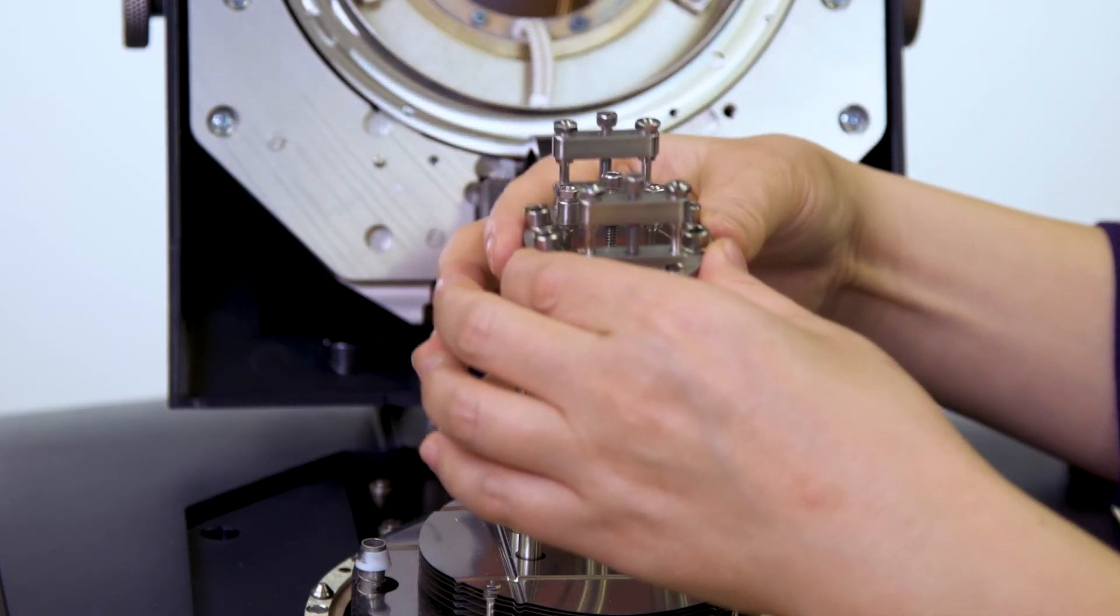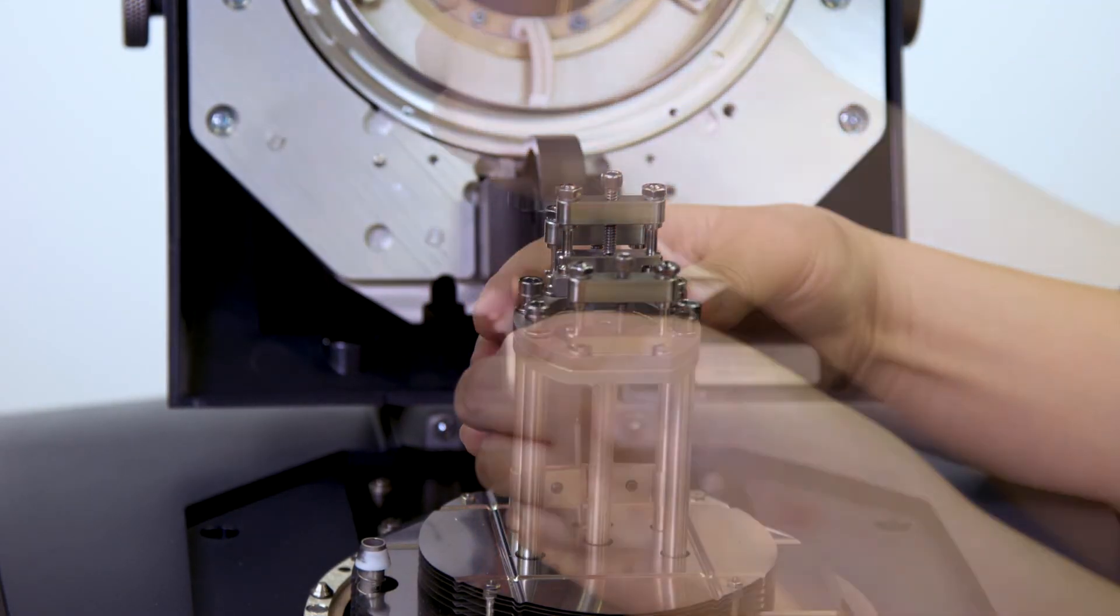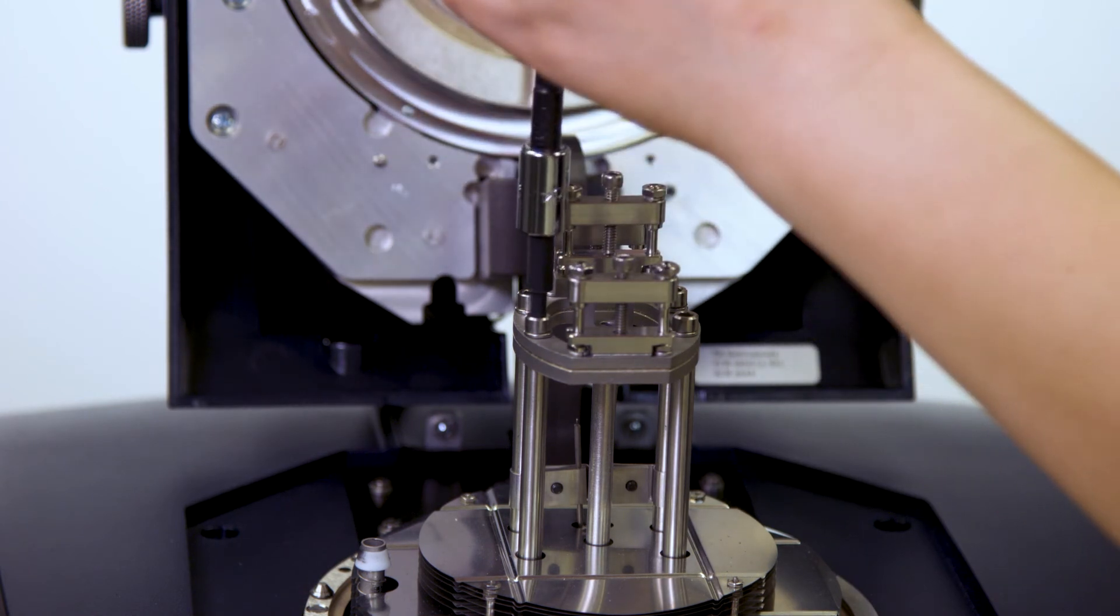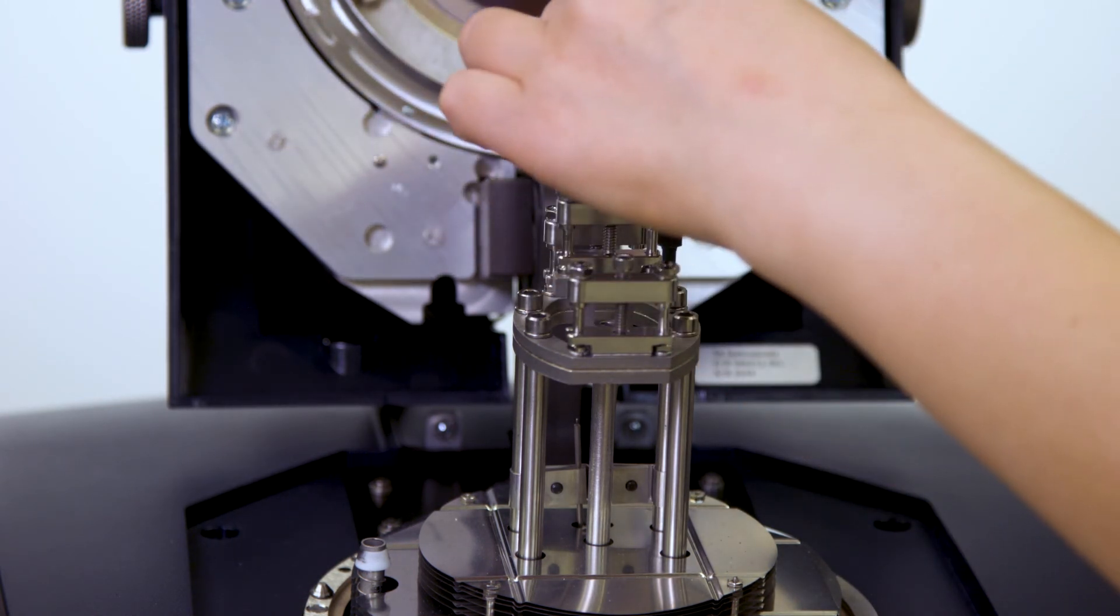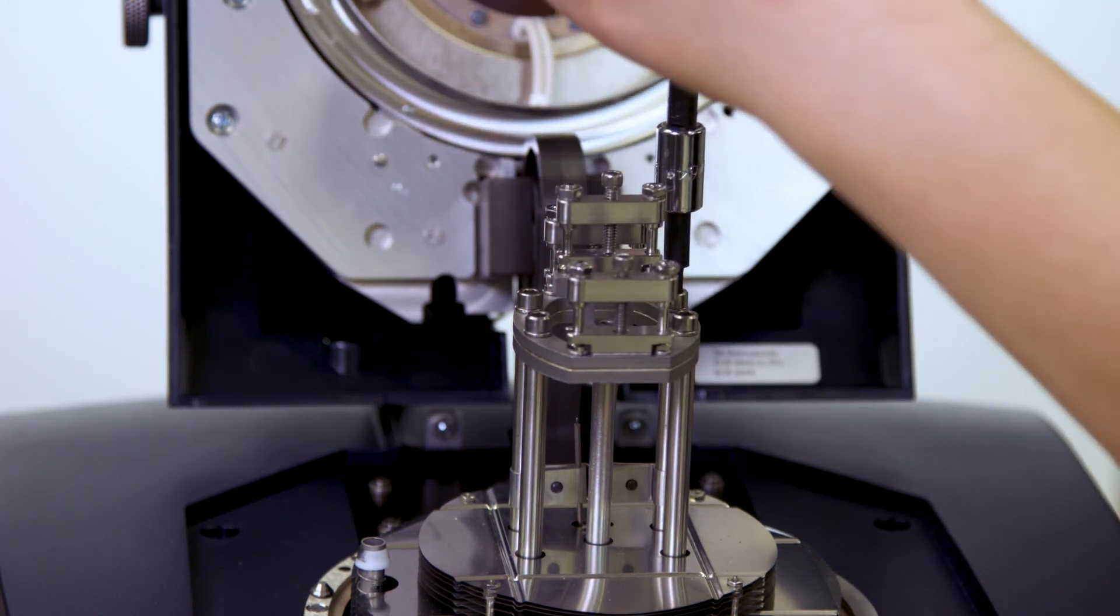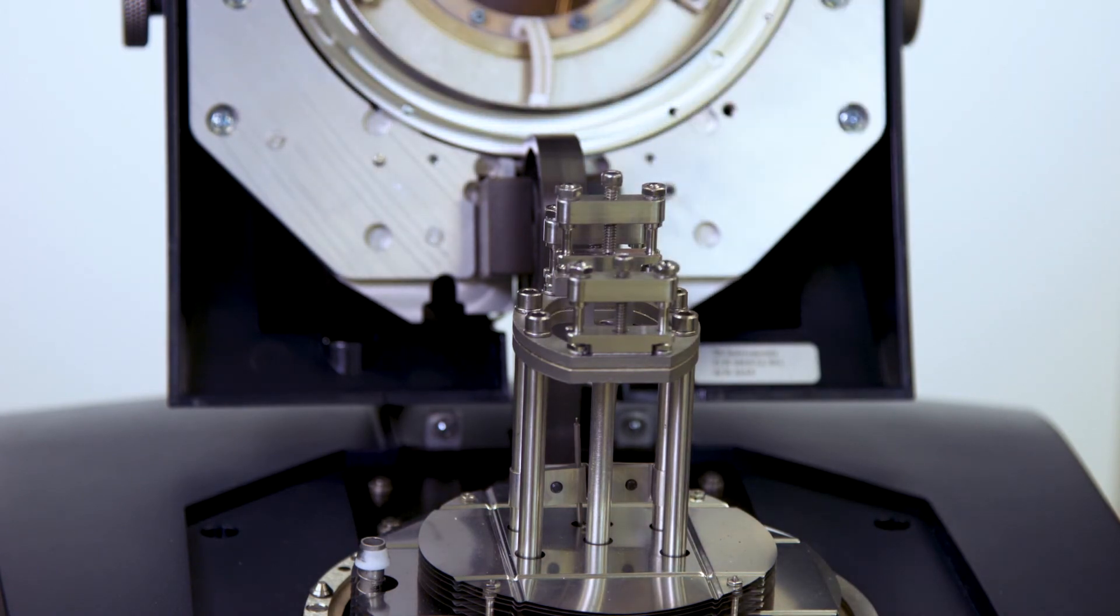The second step is clamp compliance calibration. Install the fixed clamp to the four posts. Tighten the screws with the torque wrench set to 10 inch pound.